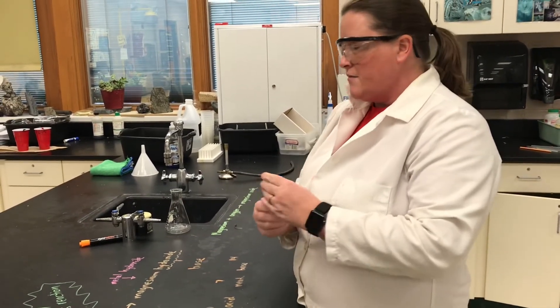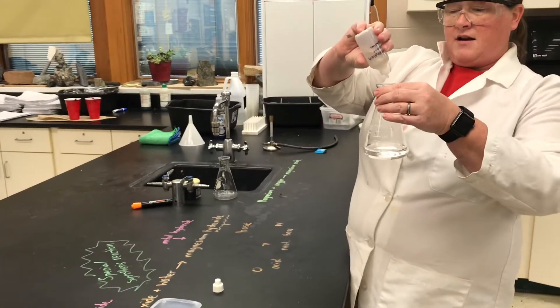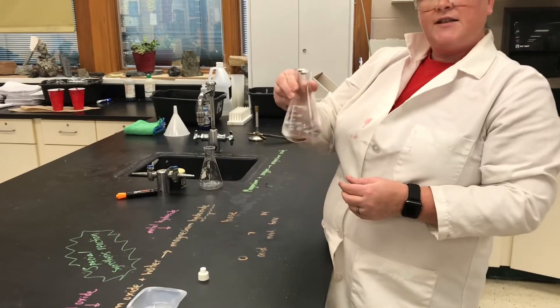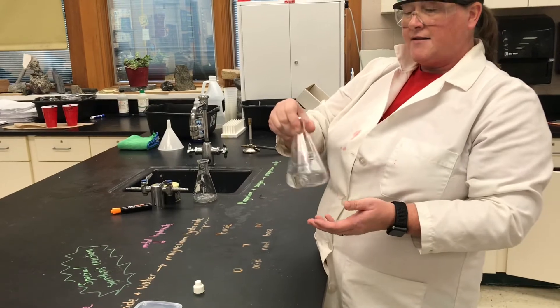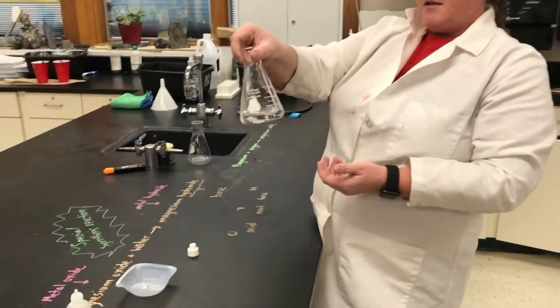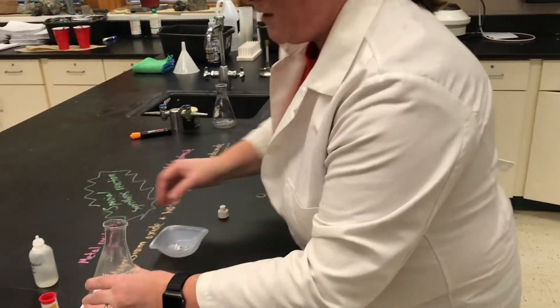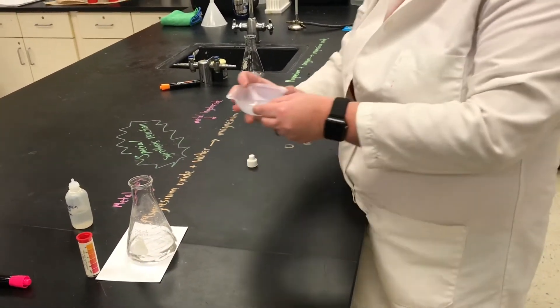I have some water here and I'll put the indicator in there. Phenolphthalein indicator will remain clear in the presence of an acid or a neutral substance, and it turns pink in the presence of a base. I'll put the flask on here and add the magnesium oxide to the water.